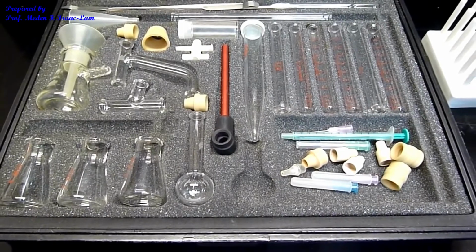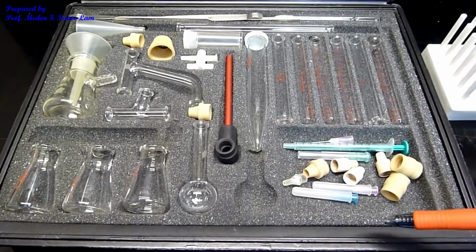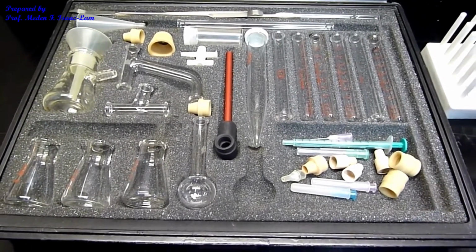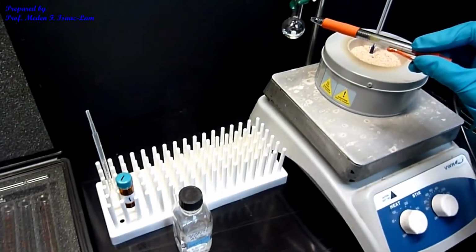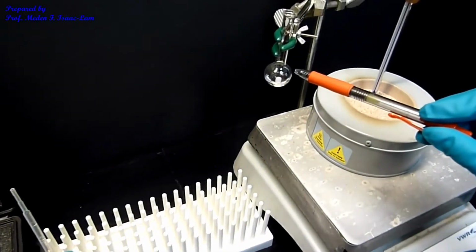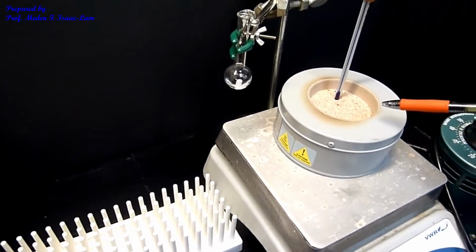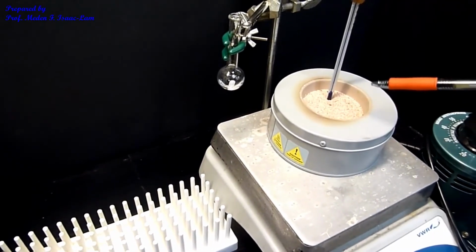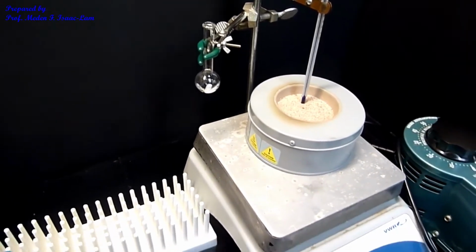So this is now the setup for the experiment, the micro kit, which I have in here. And then I took out a round bottom flask, the RBF. And I also have the setup for the sand bath. This is the thermal well with the sand. And I also have the thermometer. The sand bath is attached to the transformer.